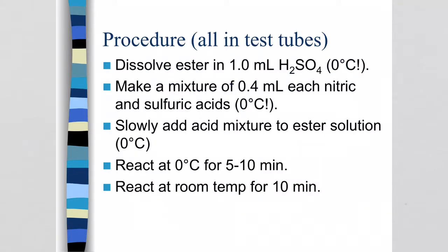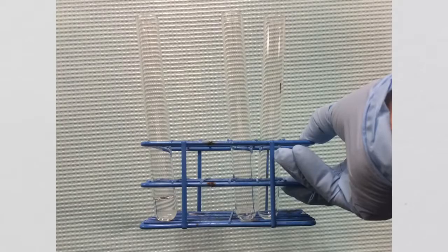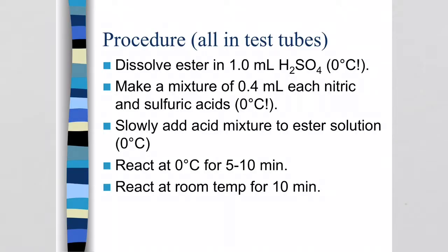Now, the process of this reaction is pretty simple. This is a microscale reaction, and we're going to use some super high-tech equipment that you can see right here, test tubes, to do the reaction in.